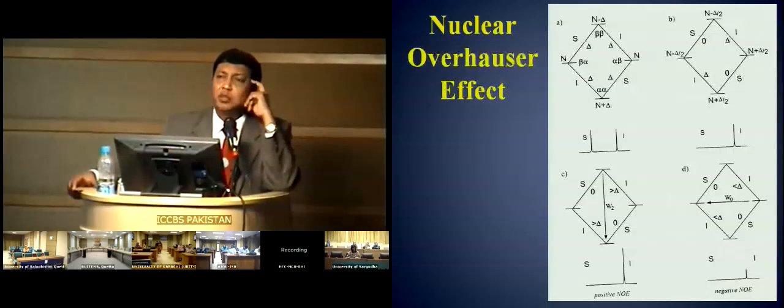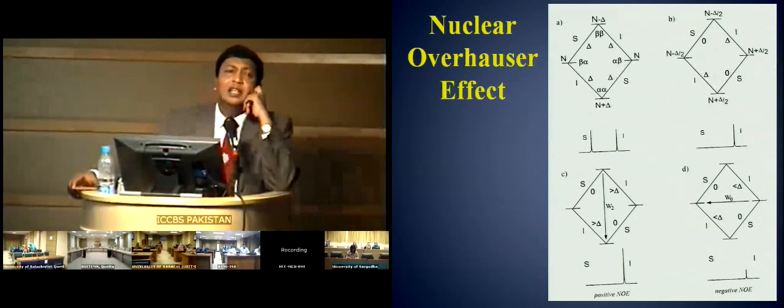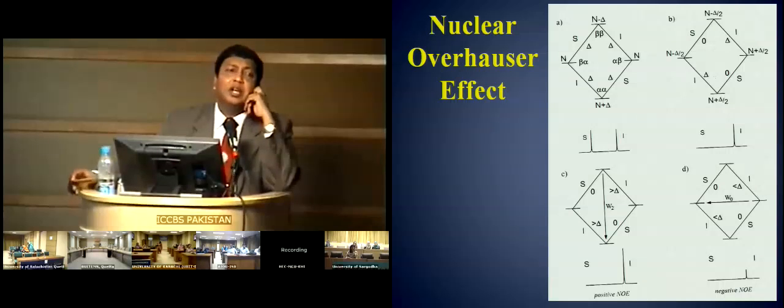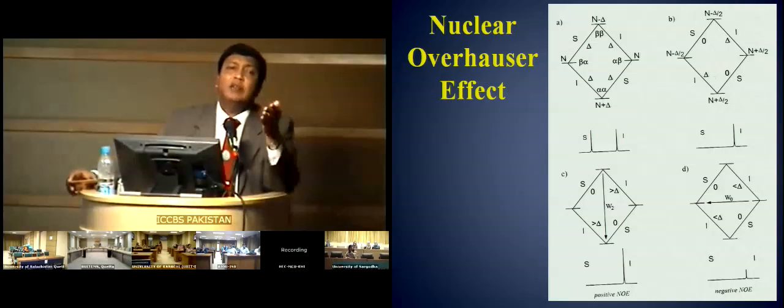And if you want this in more detail, I think you can read it in our book, Solving Problems in NMR Spectroscopy. Okay, sir, thank you very much. It is actually explained in quite a detail. But remember, this was a very valid question, and I am glad that you asked that you have a proton on C12 also. But this proton on C12 is eliminated by a BIRD. When you remove the BIRD, then you always have a polarization transfer from proton to carbon.